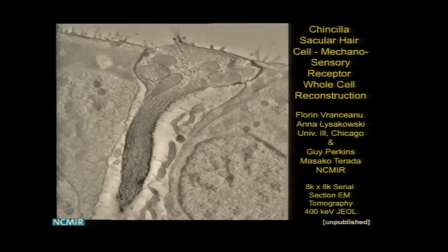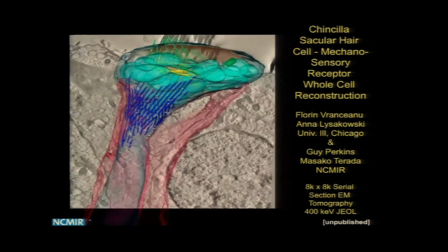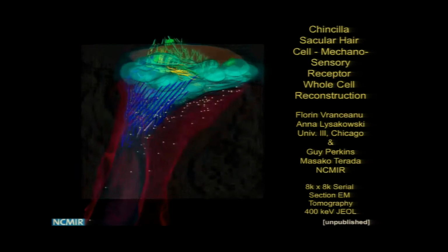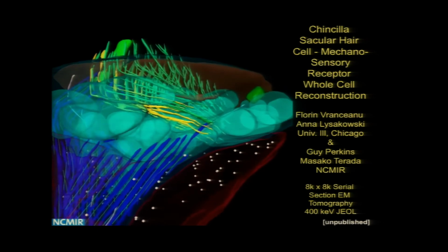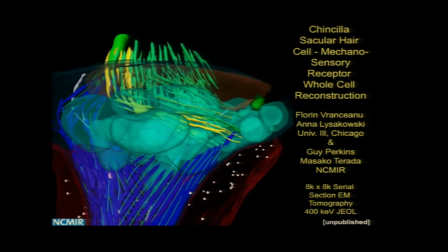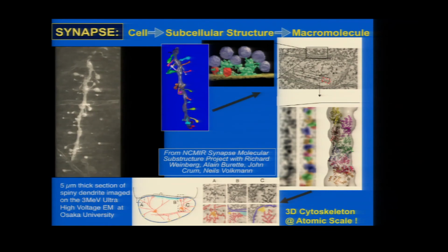And you can see this is a saccular hair cell. And here, manually, there's been quite a bit of tedious delineation of structures. You can see how great this is if you go intracellularly and you begin to map these kinds of things. I won't go through all these movies, or I'll be here for longer than I'm allowed. Probably will be anyway.